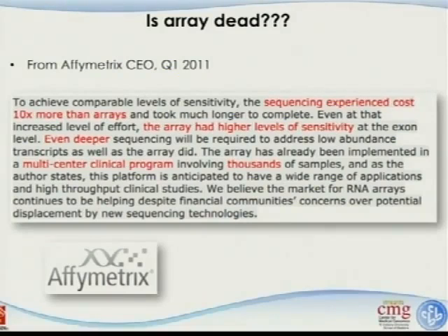And also, in terms of clinical application, if we already identify the markers, we don't really need to do the RNA sequencing to do this type of global profiling of everything. We can design only the best markers on the array and run through the chip. And I think the RNA sequencing development really pushed Affymetrix more towards the clinical markets, which is probably a good thing for them. Okay? The conclusion here is array is not dead. They still have their specific applications.